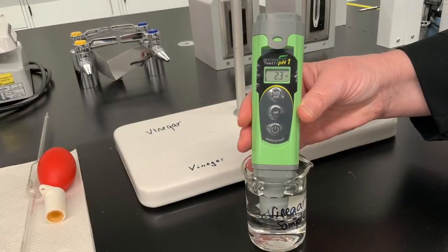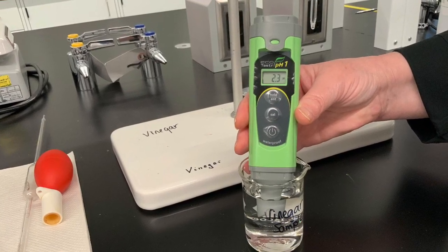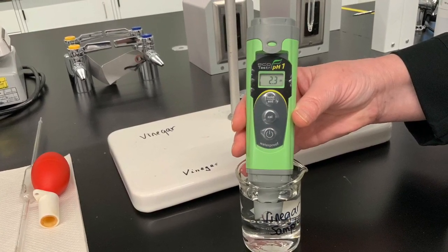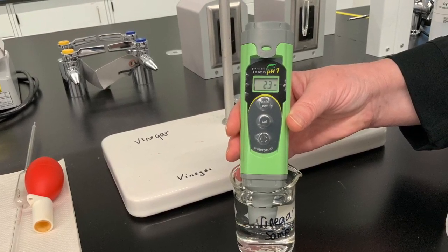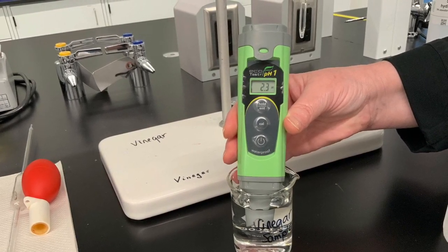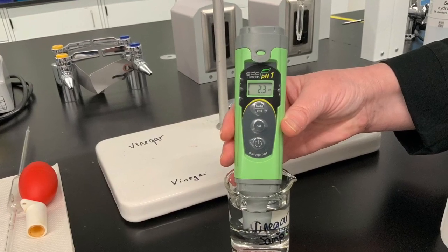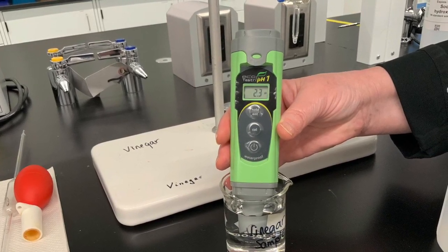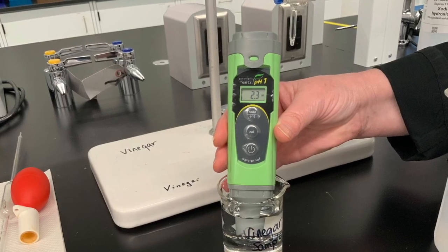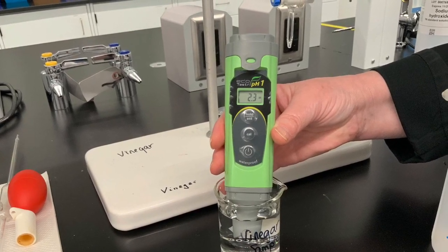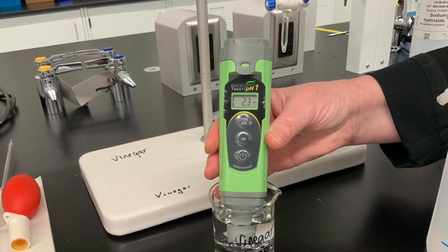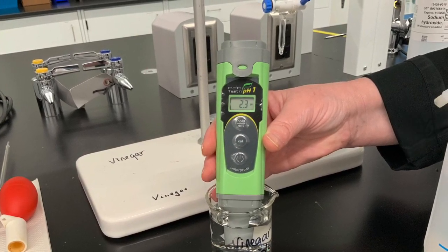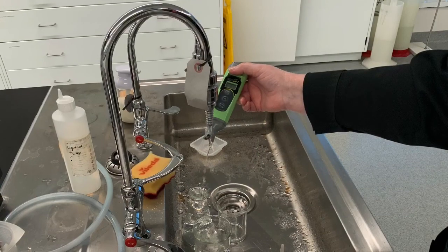One last thing for the lab write-up. You learned that acetic acid is a weak acid. And so consequently, if we measured the pH, as you can see here on the picture, the pH would indicate a very different acid concentration than what your titration has determined. And it's going to be one part of your write-up to determine and to compare the two numbers: the acid concentration based on its pH and the acid concentration based on the titration.